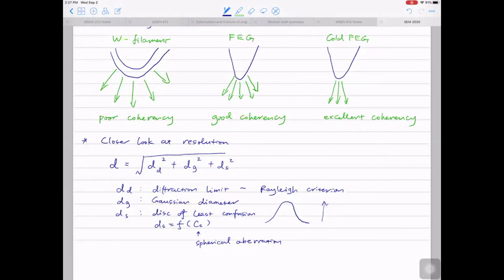So as a scientist, you do the calculation using the Rayleigh criterion. You calculate the resolution limit. But as an engineer, you have to think a lot more than that. Any questions before we switch to the PPT? I know we went a bit over time, but I'll try to finish everything within 5 minutes. Any questions?